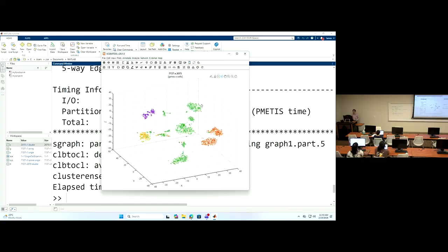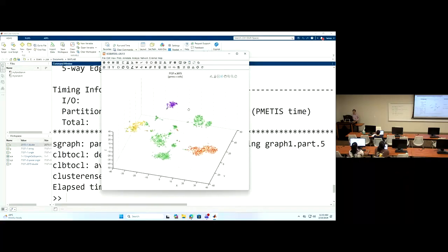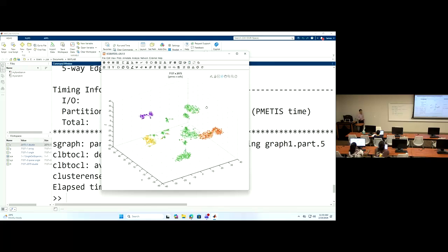Okay, so that's your cluster result using SC3. Again, that's not straightforward, because the input for this is the expression matrix itself. It's not considering how you pre-processed your data using t-SNE and where you put the cells in this 3D space. So this algorithm will not respect any of the locations of the cells, and your result may not be as good as you expect to see. Okay, this is a clear cluster, because SC3 does not need to consider this as a separated cluster.